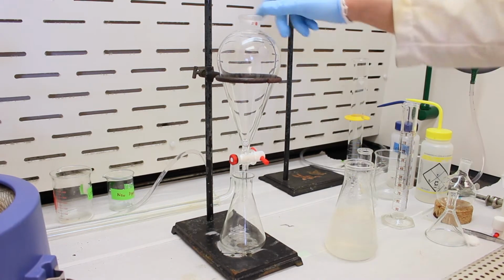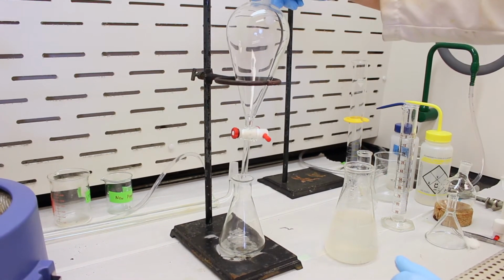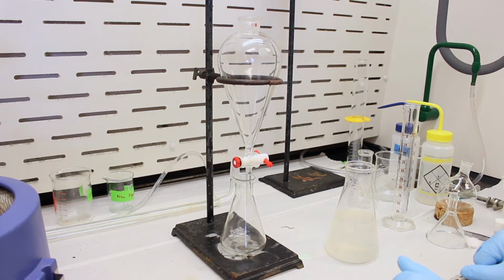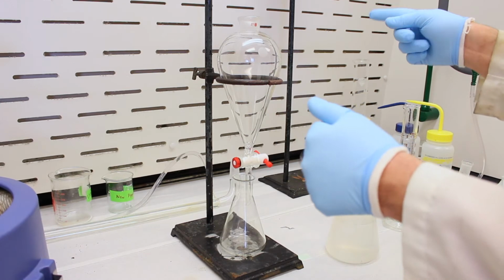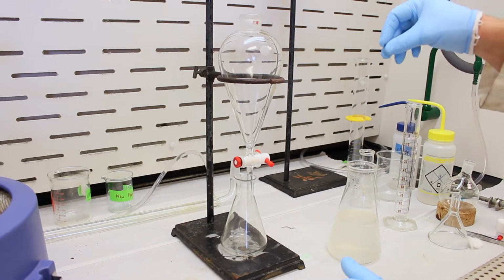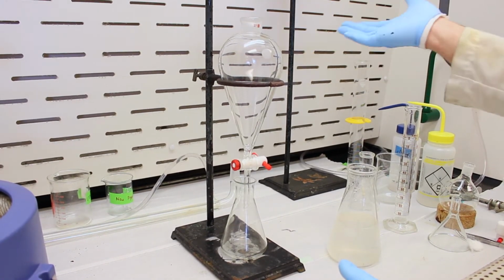So this is our separatory funnel, which is, by the way, my favorite piece of glassware. It's basically a gravy separator. At Thanksgiving, you have a little cup with a spout, and it'll separate the gravy from the turkey fat. So this is a device that does the same thing, only it's made of glass.